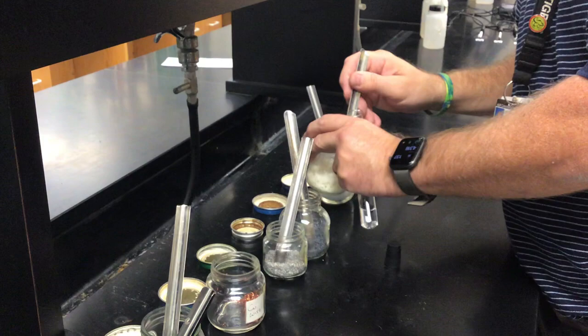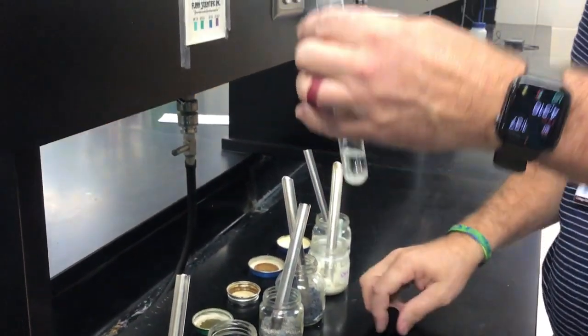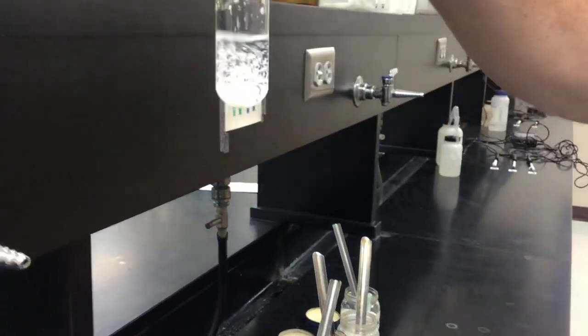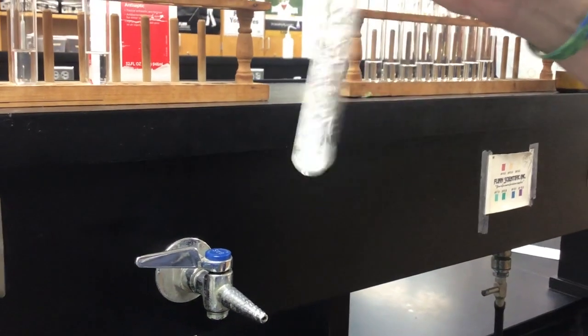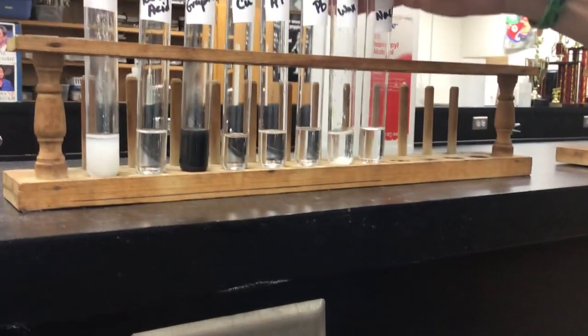Okay, and then wax. A little bit of wax out of here, this nastiness. A little bit of wax in there. So wax and isopropyl alcohol. We'll come back and look at that in a couple minutes too.